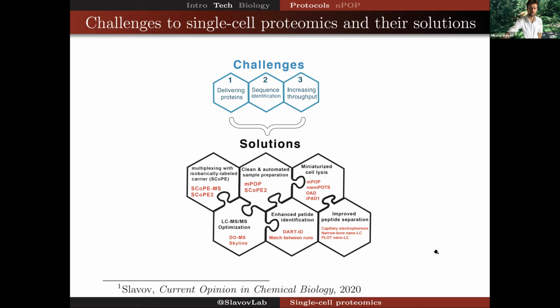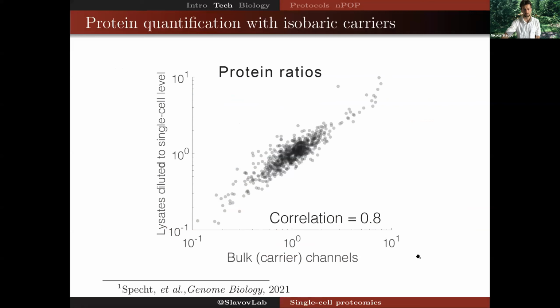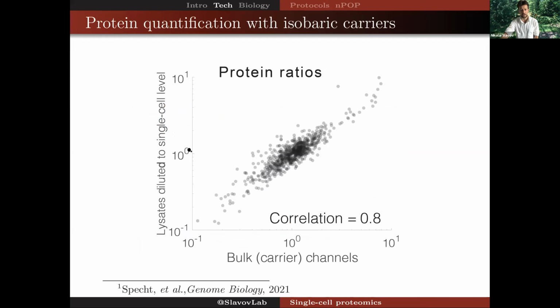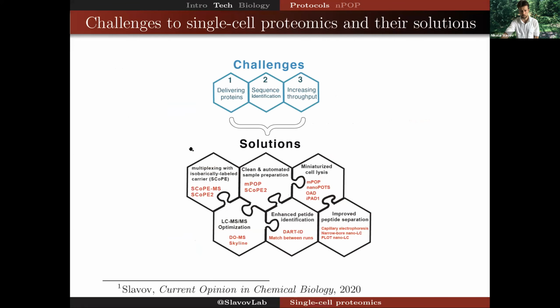So it turned out that this very simple, well-established approach of sorting the cells into a multi-well plate with a sorter has worked well for us with cell lines, but it did not work well enough for us with the primary samples from human testes as part of our CZI project. So we routinely found that sorted cells gave us very low signal, and that was a painful troubleshooting approach.